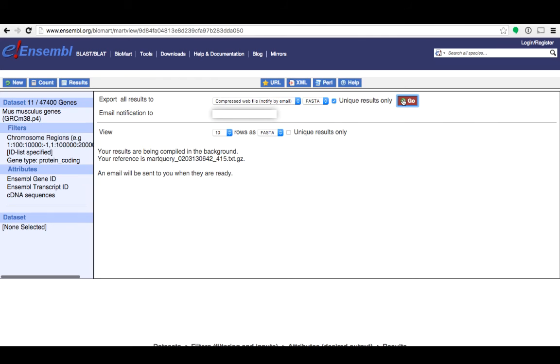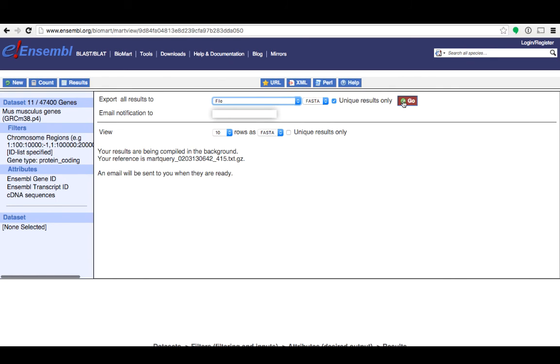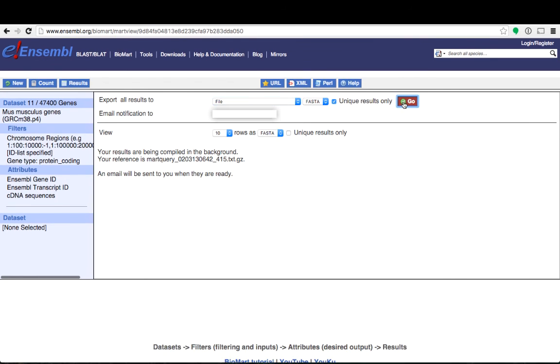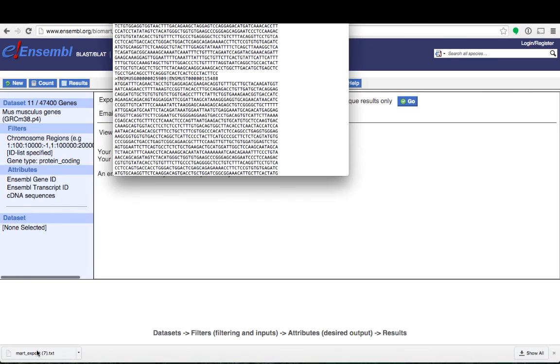Alternatively if you just have a few sequences you can download the file immediately by clicking file and then go. You can see a file has appeared in my downloads bar. I'll open this file and you can see a number of sequences here with the FASTA header with the Ensembl gene ID and the Ensembl transcript ID followed by the sequence.